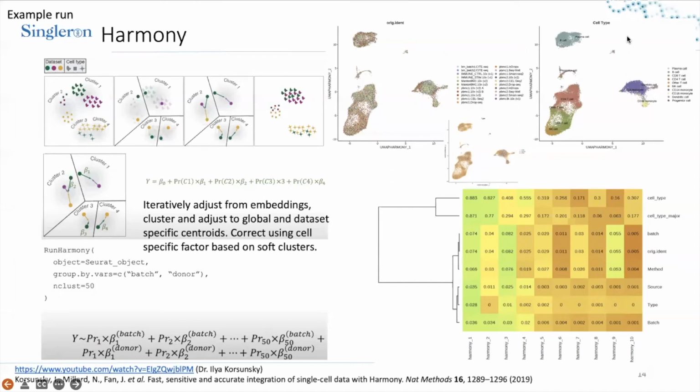As we can see here, the cell types are very well separated. The CD14 monocytes, CD16 monocytes, and dendritic cells are located together, and the T cells and NK cells, their locations in the cell type UMAP make a lot of sense. The plasma cells are grouped together with the B cells. When we look at the batches, Harmony could be slightly overcorrecting.